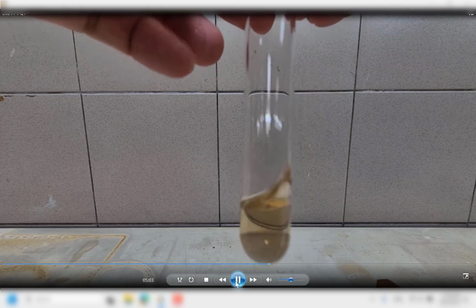Okay, now after adding, this is what we get. A lot of you actually claim that this solution is yellow. Some of you claim that it is orange. But it's actually brown. So you have to be very careful. I know you can say it's a different shade of brown that might cause you to misinterpret it as yellow or orange, but if you look at it really carefully, it's really more brown than anything else.